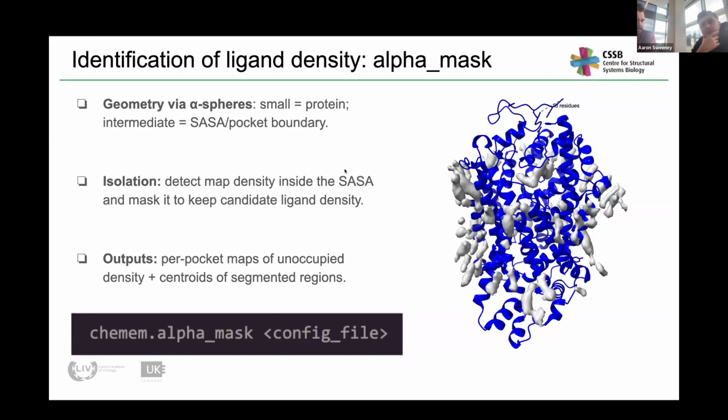For ChemEM, I probably wouldn't go lower than 6. Just at this resolution for such small molecules, you haven't really got the fine detail to make a credible model anyway. It will still do it. But I'd interpret it with caution, definitely.